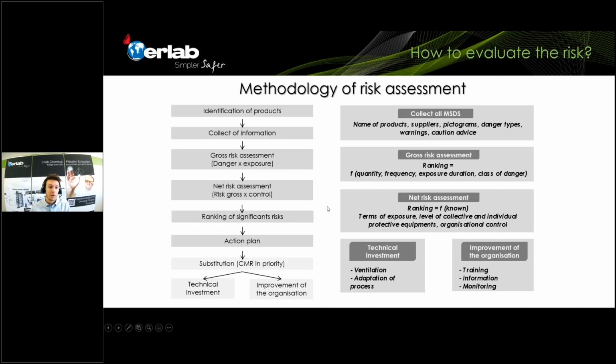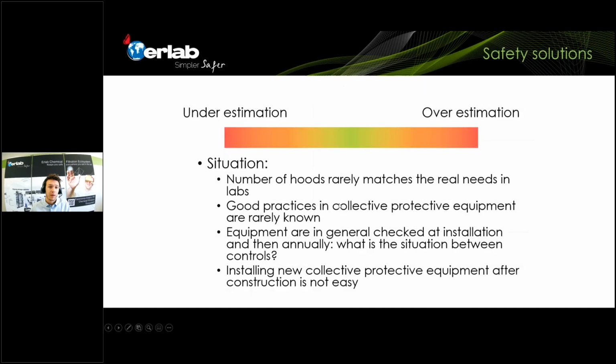If we talk about technical solutions, so technical equipment, more in depth about those things, so technical equipment safety solutions, there can be an overestimation and an underestimation, which is very frequent when we visit laboratories ourselves. We see often that people have many different hoods that are not always used, or not always used for the application that they're supposed to be used. They're not always the good practices.